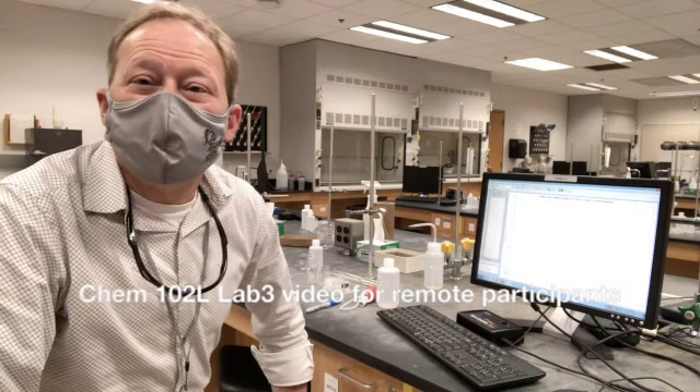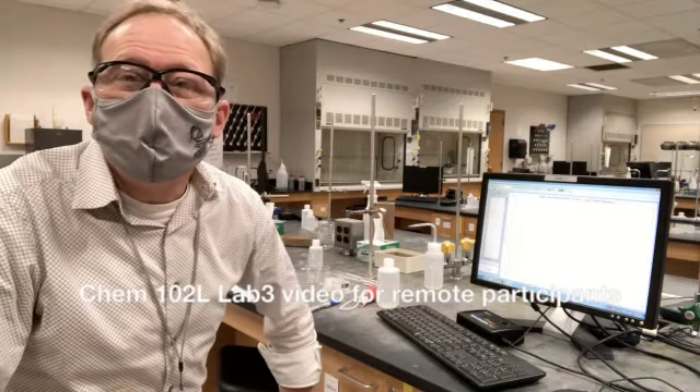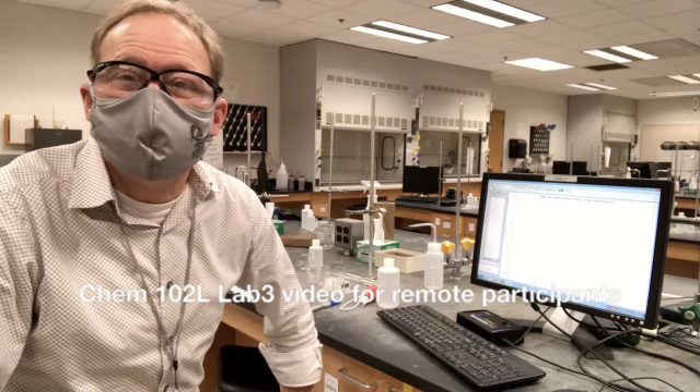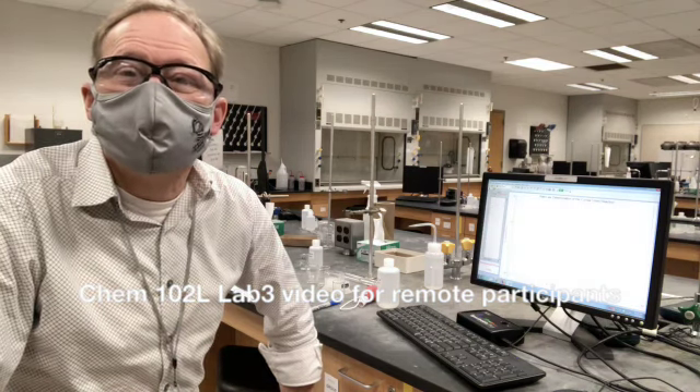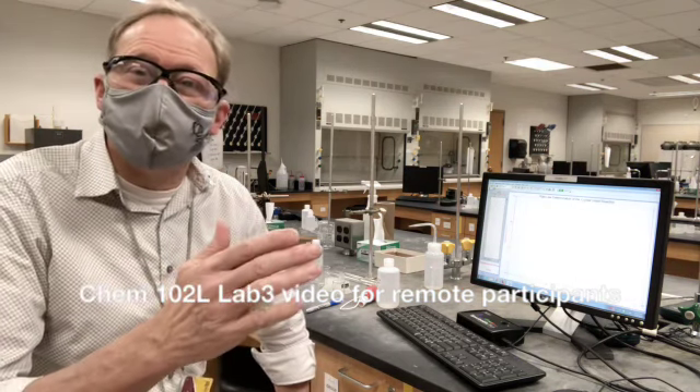Well hello again, I'm Professor Meiskins. I'm going to get my lab glasses on. I'm going to give you a demonstration of the liquid handling techniques for this lab three, where we're watching the kinetics of crystal violet.